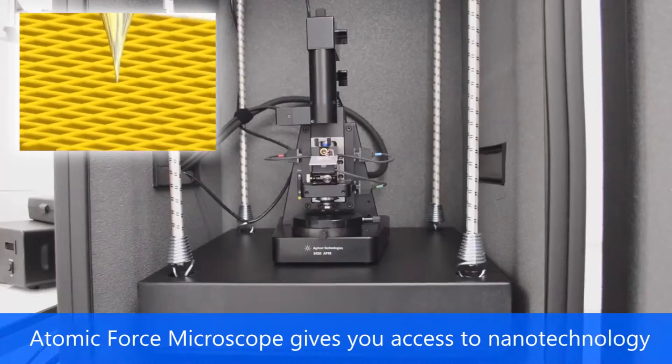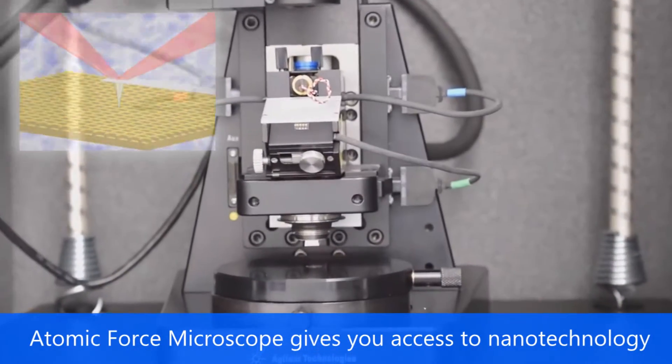A small antenna-like probe called a cantilever scrapes along the surface of the material.